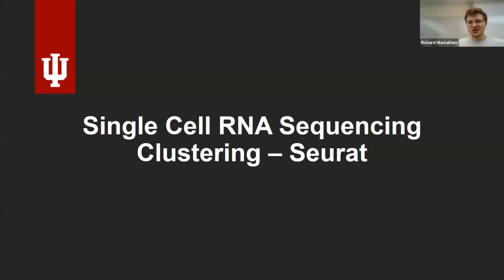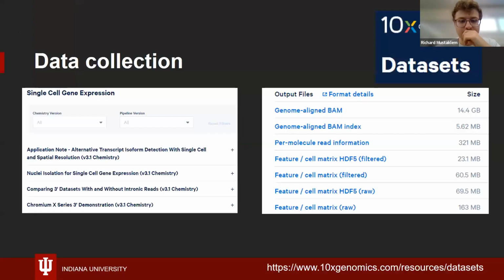Yep. So I have a long presentation, but my colleagues here in the club told me it's better to go through this manually. So I'm gonna show you guys how to download this data first. Basically, you're just gonna go to this website, 10xgenomics.com, and I'm gonna show you on my screen too later. This is outdated because they recently changed their website, so I'm gonna manually walk through it after.